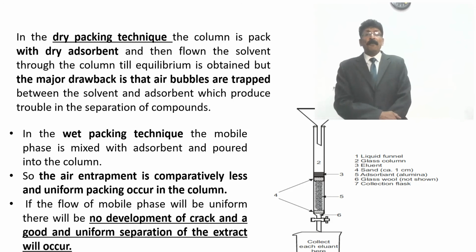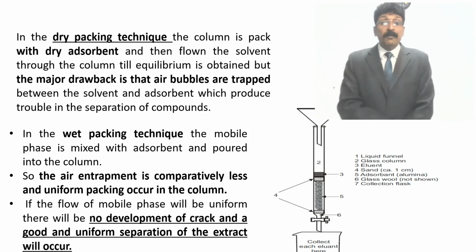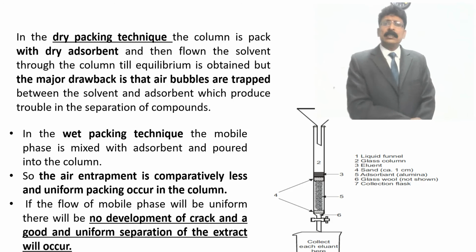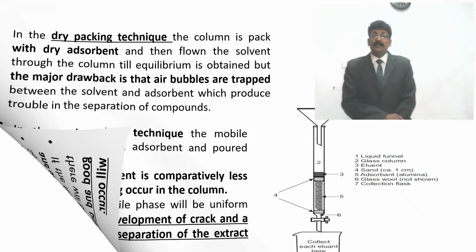If the flow of the mobile phase is uniform, there will be no development of cracks, and a good, uniform separation of the extract will occur.